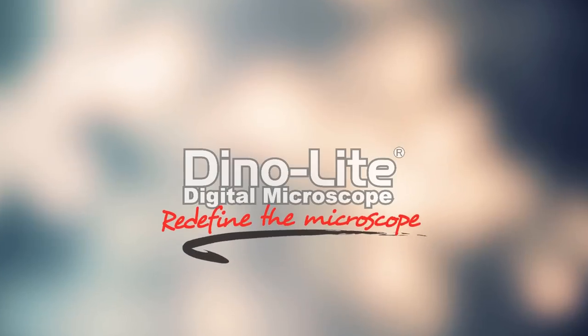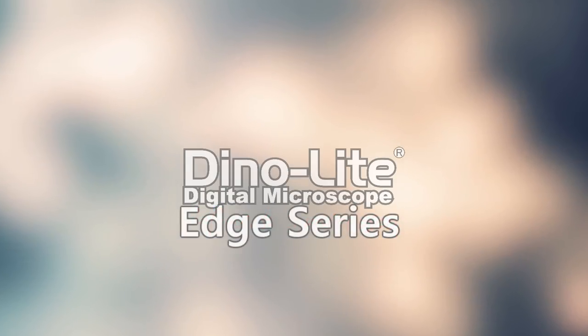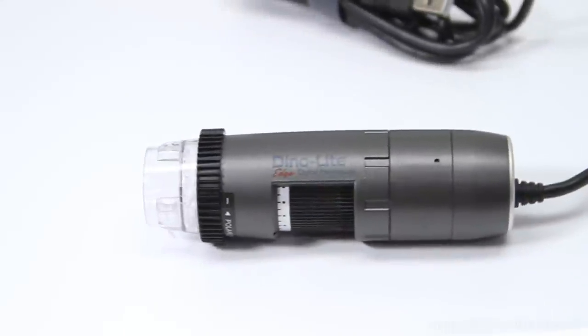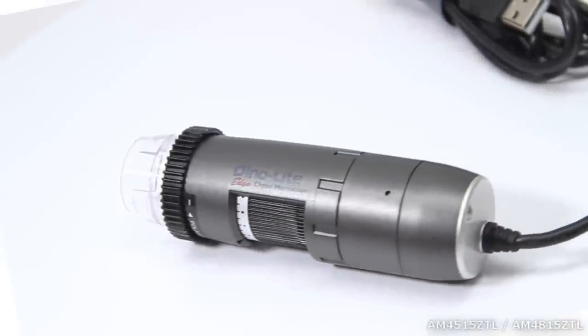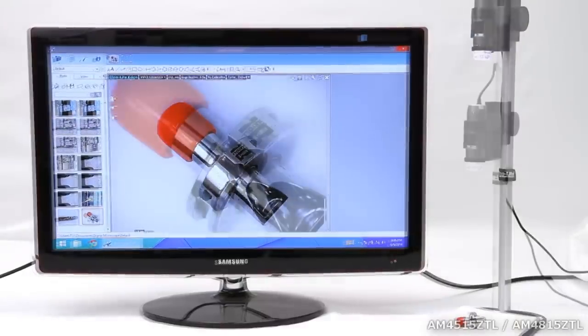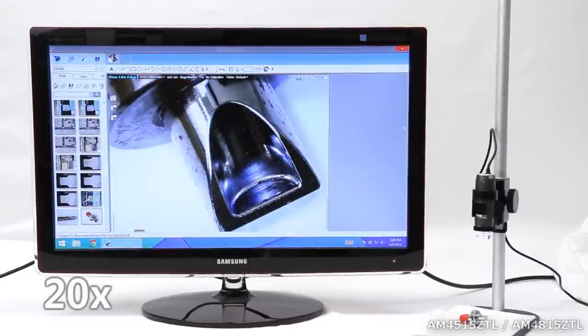Introducing the Dynolite Edge Series longer working distance models AM4515ZTL and AM4815ZTL. These two Dynolite Edge Series microscope cameras each offer an additional feature only available for Windows users.